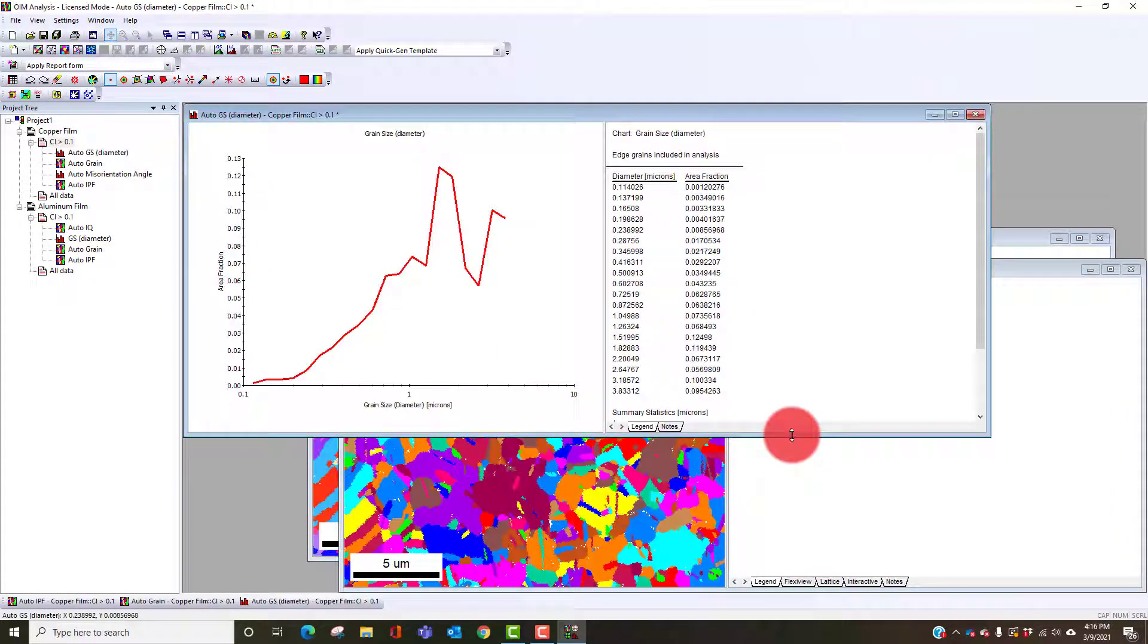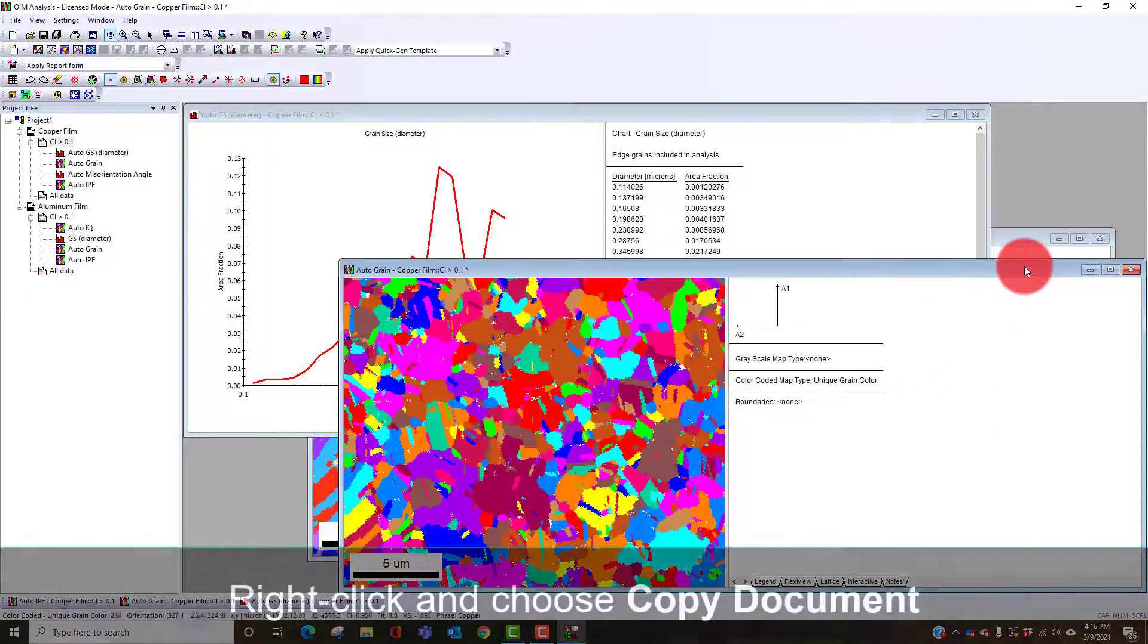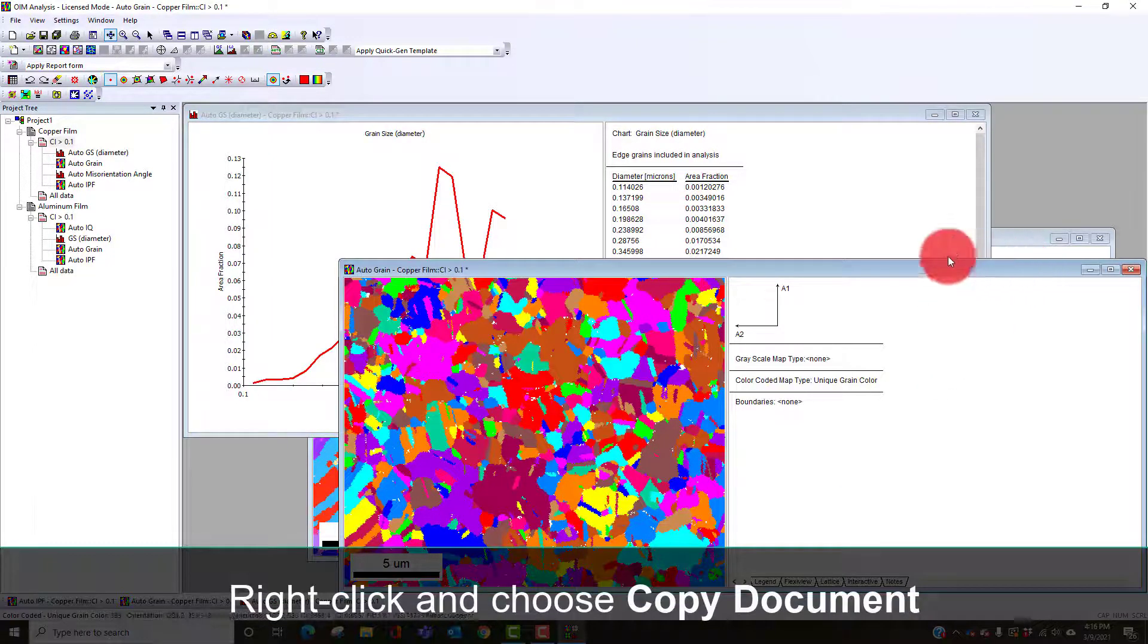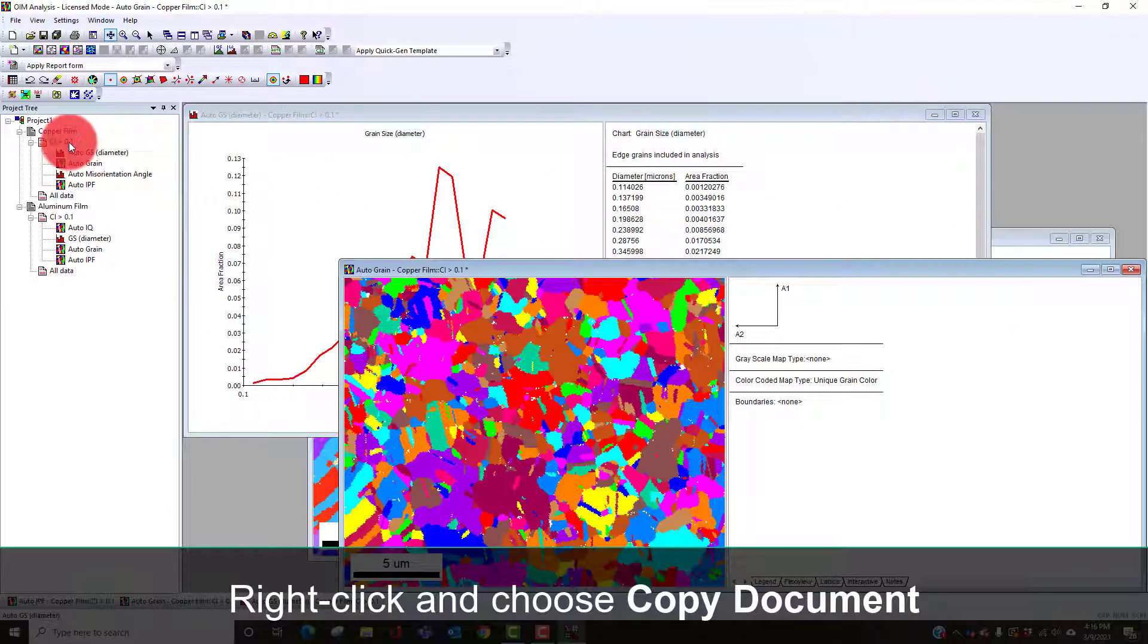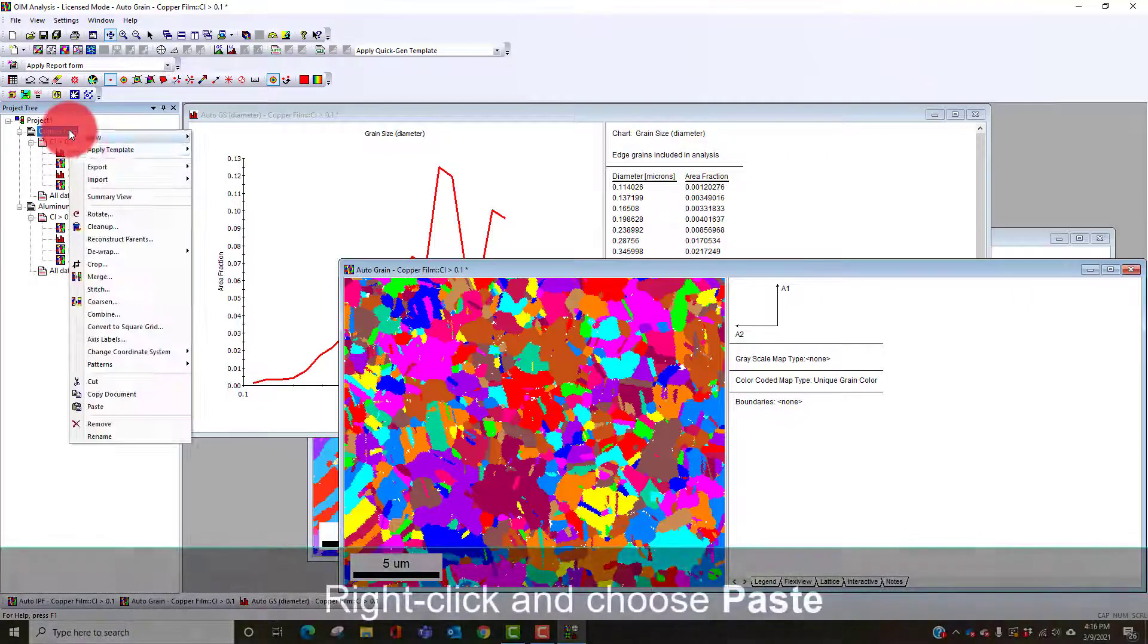If we look initially at our grain map and our grain size distribution, this is kind of that side of distribution with an area fraction.